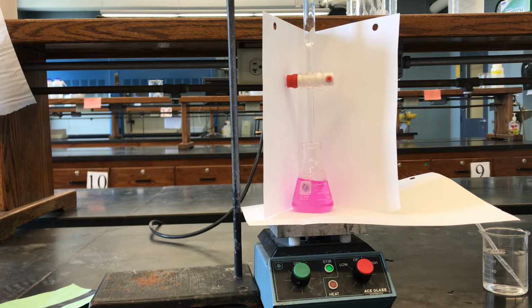Okay, there's trial 2. You can see we're a little bit brighter than last time, but it was just that last drop that caused it to turn pink, so we're good.